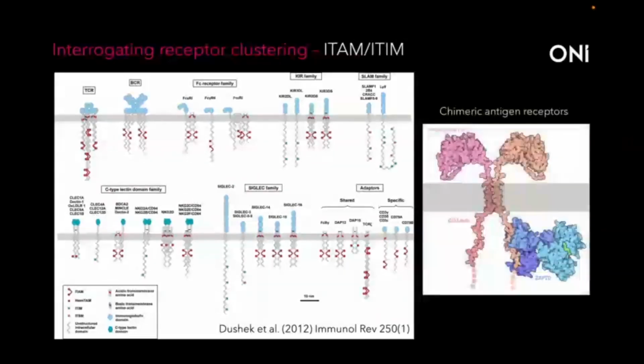They are also applicable to engineered molecules, such as chimeric antigen receptors, which tend to be engineered on a fairly modular basis by chopping and changing different signaling domains from various natural receptors in order to elicit a particular response. So, for example, where the docking site for a ZAP70 molecule or a SHP1 molecule is on the length of a particular chimeric antigen receptor will impact how it clusters. It will impact how it has molecular reach on the surrounding molecules. But again, all of that is only accessible through super resolution microscopy.